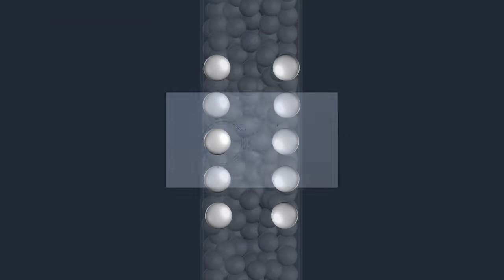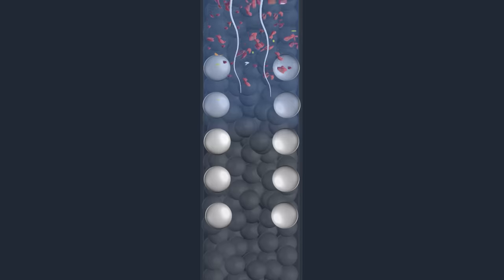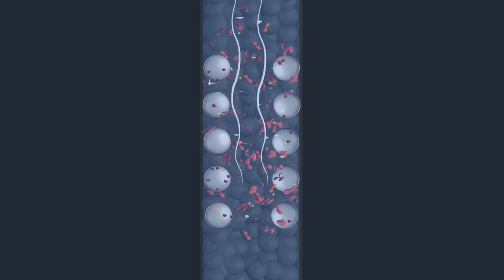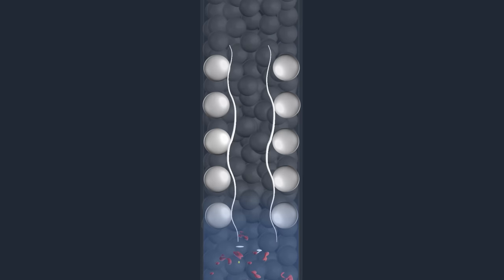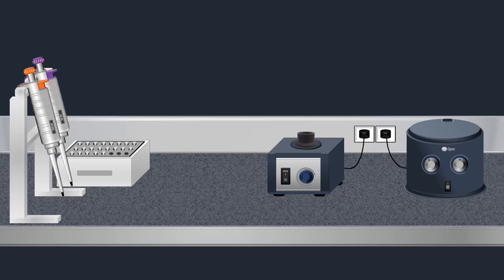Under optimal salt and pH conditions, RNA molecules bind to the silica gel membrane and at the same time, protein and other contaminants are not retained. After centrifugation, the spin column is placed into a clean collection tube and the filtrate is discarded.